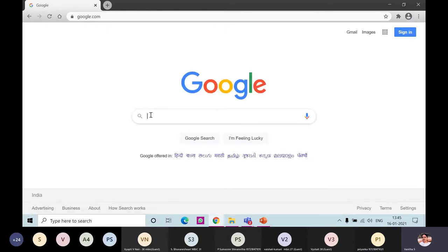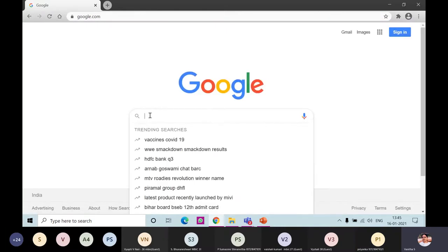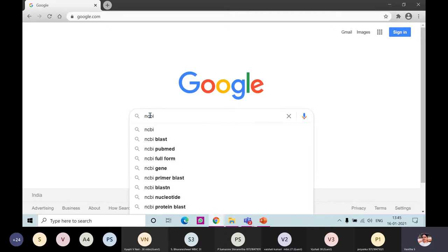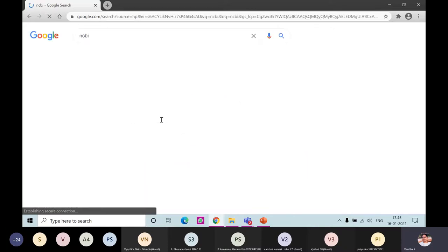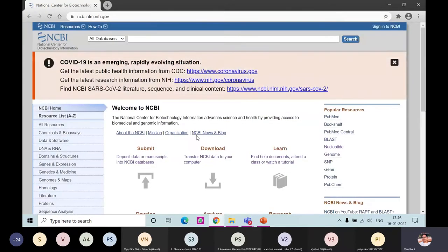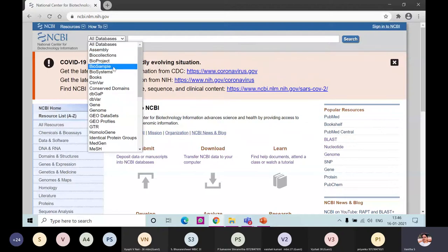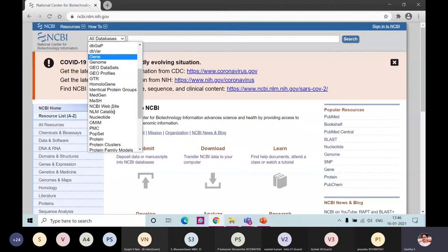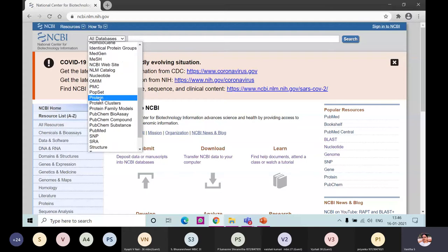Open Google and search for NCBI - it is a very good search engine. Type 'ncbi' and press enter. The site will open; click on it and the home page will appear. Once you're on the home page, go to 'All Databases' where you can see options like project, samples, books, gene, genome, and the NCBI website. Select 'Protein' by clicking on it.